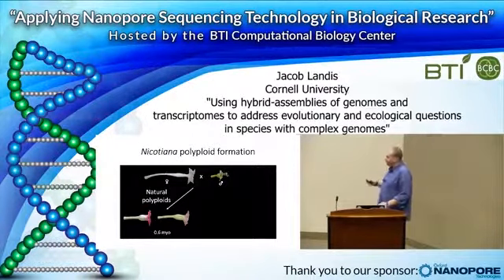So we have the two progenitors, and these were sequenced several years ago. We have about 250-some thousand contigs of the maternal parent and about 160,000 contigs of the paternal parent. The median contigs are not very big. The N50s are okay, and it's assembling not all of, but quite a bit of the genome. Then we have tobacco right here. It has over 1 million contigs and fairly larger N50 values, but it's missing more of the genome.